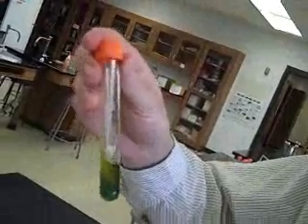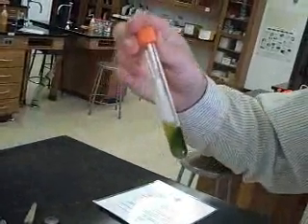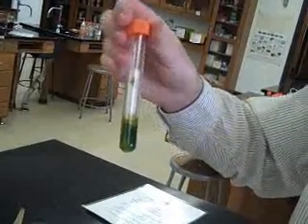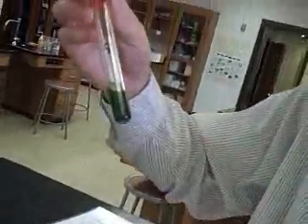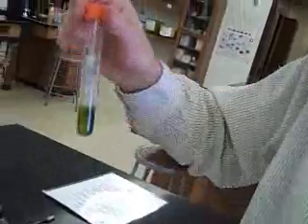For example, our two control tubes with the water did not have any color change, they just stayed green. Our tube with the glucose did turn a little bit yellow, and you can see some foam, that is carbon dioxide gas appearing, because there was respiration. Tube 4 was fructose. You can see there's a lot of yellow color and lots of foam. That means the fructose did react with the yeast. And tube 5 was galactose, and nothing happened because it can't digest galactose. Tube 6, sucrose. It can digest sucrose. You can see it's got some foam and you see yellow color.